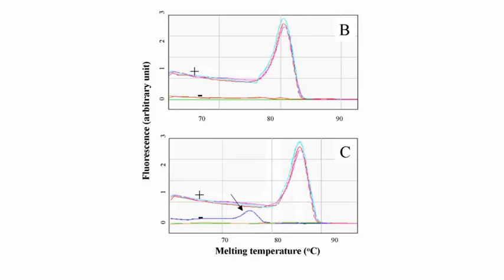If you have non-specific reactions that are occurring, they're also going to have a potentially different melting temperature than your ideal target here. And so what you will see is you'll see this little extra bump as your primer dimers are starting to melt, and you'll compare this to, okay, well, I've gotten rid of some primer dimers, but here is still my overall activity of fluorescence.